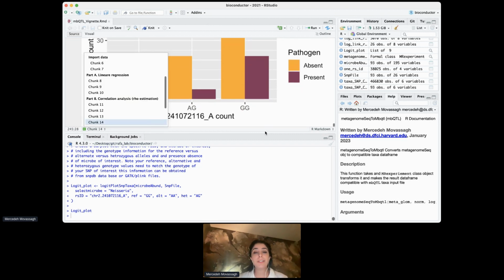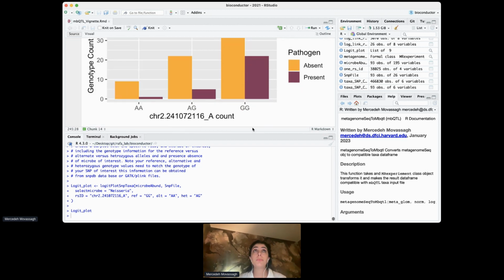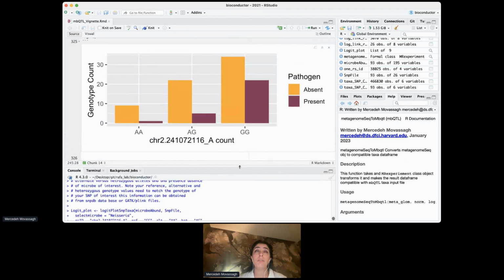So overall, this is pretty fast. Depending on the size, you could really run the whole analysis in like 5 minutes. However, it depends on the size of the files. This particular analysis was with around 1,500 genus of microbes.